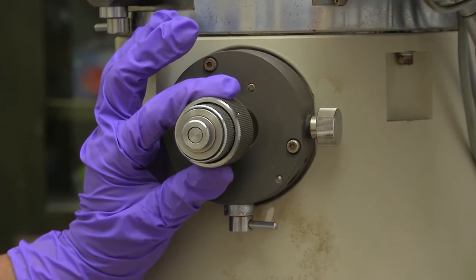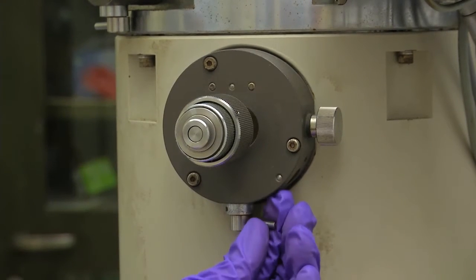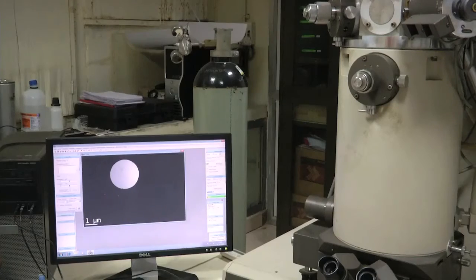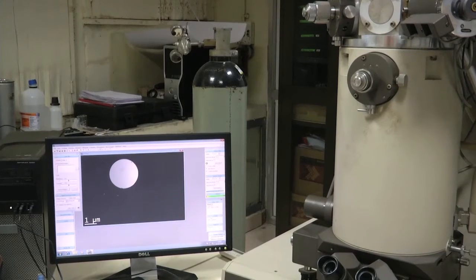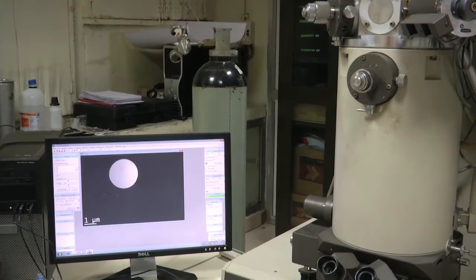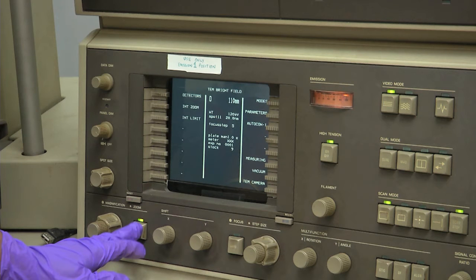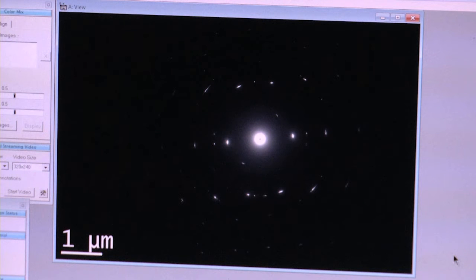With this unit you can get crystallographic information. This is the selected area diffraction aperture. When we insert this aperture, you can select an area from the image. I have reduced the aperture size. The purpose of this aperture is to select the area and go for diffraction. When I press this, the selected area gives a diffraction pattern — this is a diffraction pattern from the selected area.